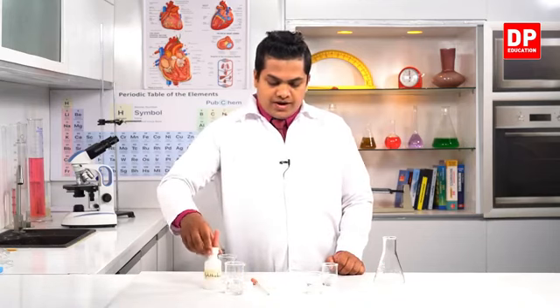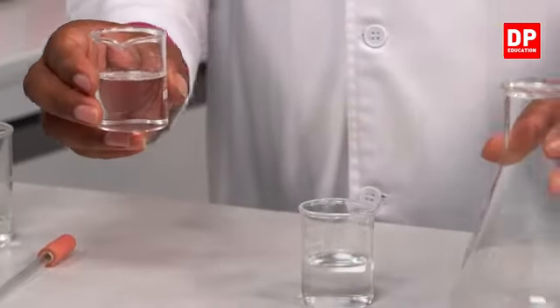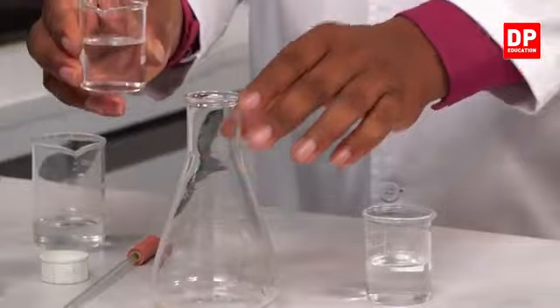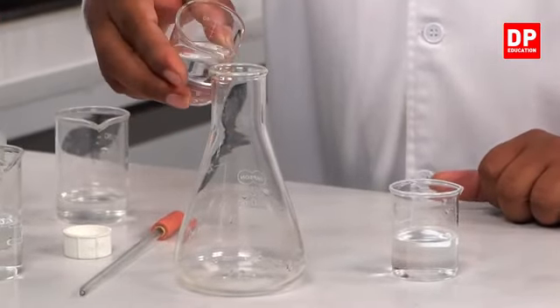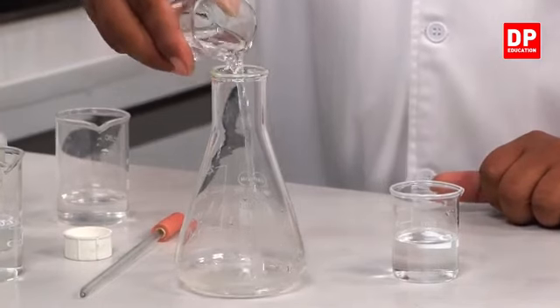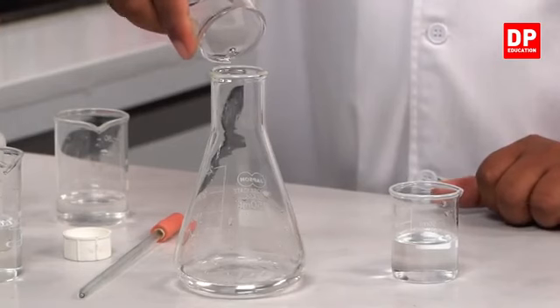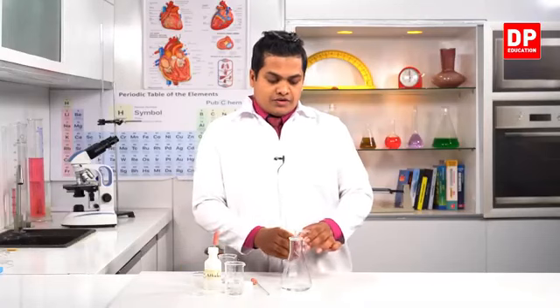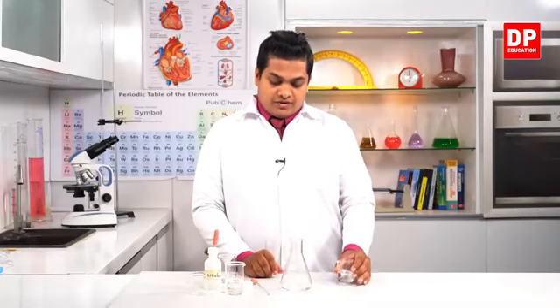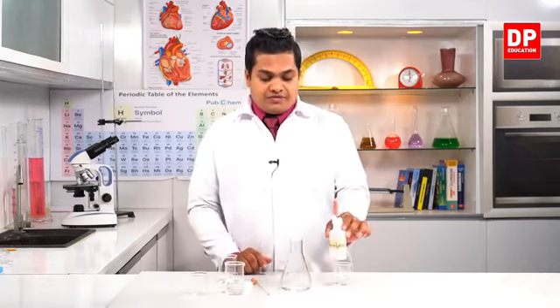Now I am going to add the earlier measured sodium hydroxide solution to our vessel.